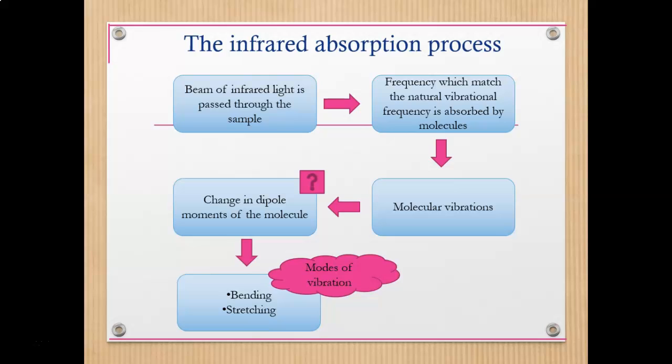Stretching is like you pull the material in opposite directions. Bending vibration will change the angle between the two bonds.